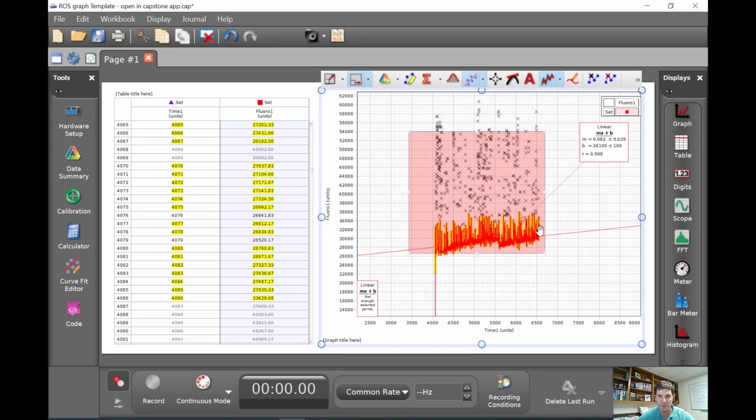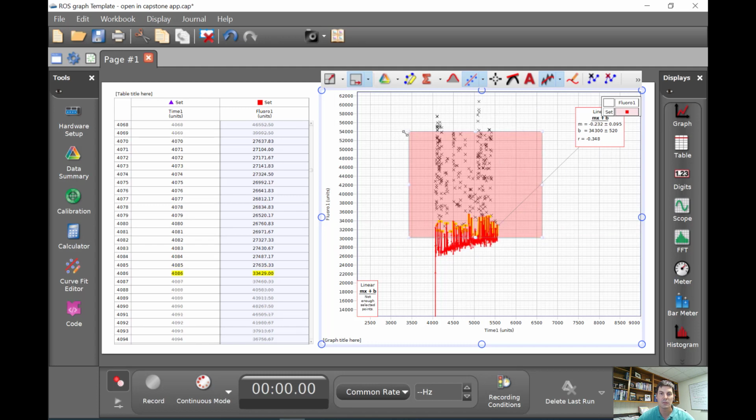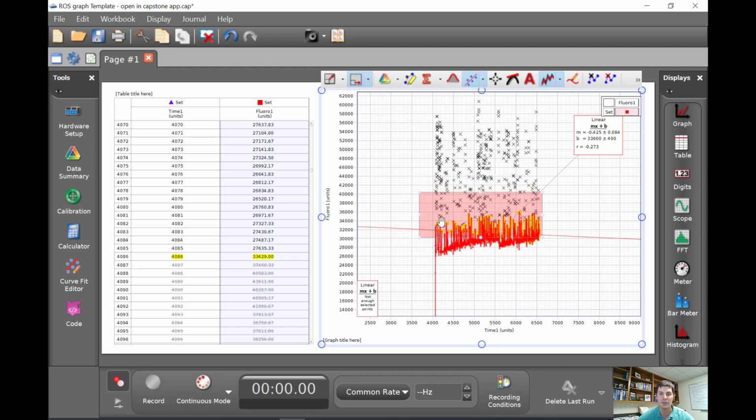So again, I'm going to follow that same process here. As you can tell, my computer doesn't really love me recording video and isolating this. So what I'm going to do really fast is do this one more time. We're going to zoom in and get more data points, click here and exclude highlighted data. I'm going to pause the video, get this cleaned up how I would want it, and then show you the final product, because as you can see, my computer is going to lag really heavily as we continue to do way too much on it.